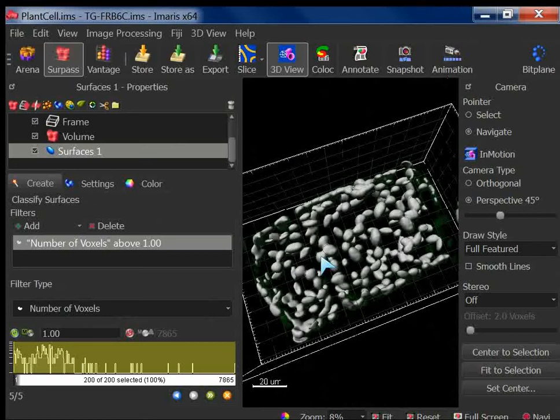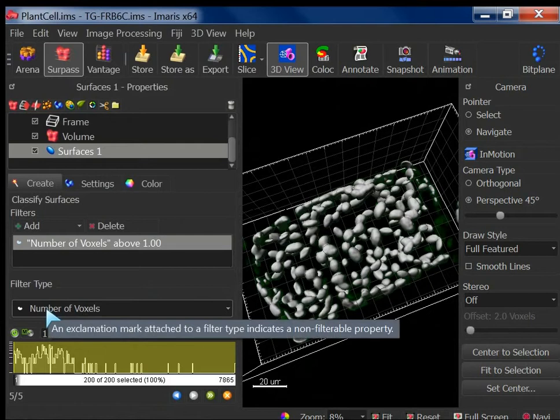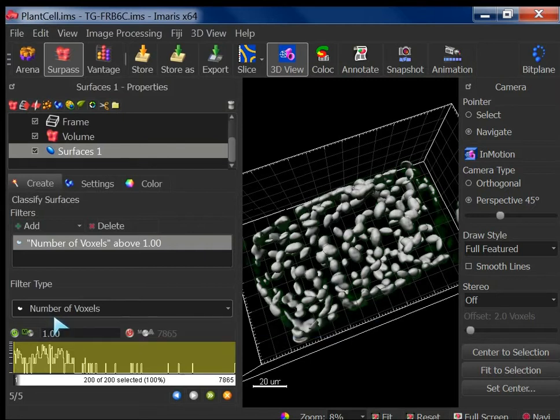You can do it here also, or maybe even after the creation of your wizard is possible. But if you want to apply this hypothesis on all of your data, again, it's important to do all the filtering in the wizard, so that in the wizard this information is there and it is applicable to all the images. Okay? Instead of doing it later.